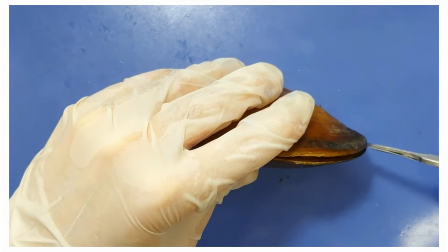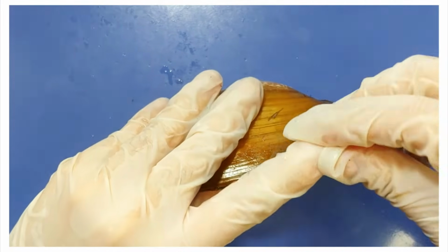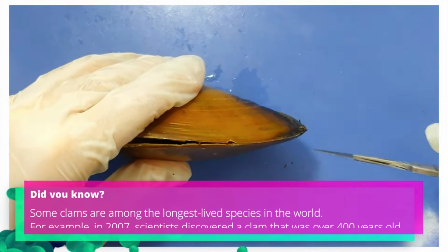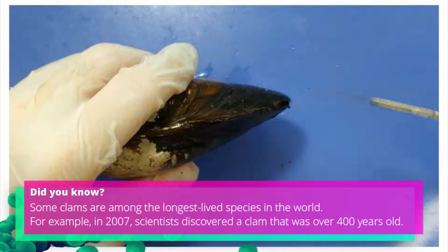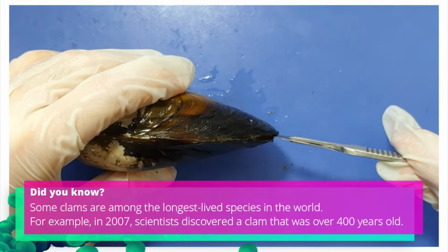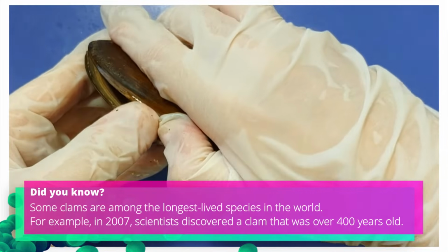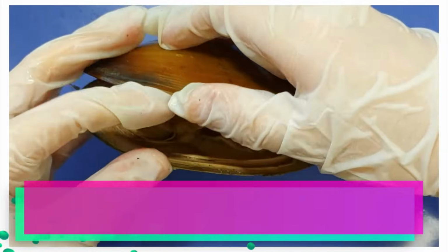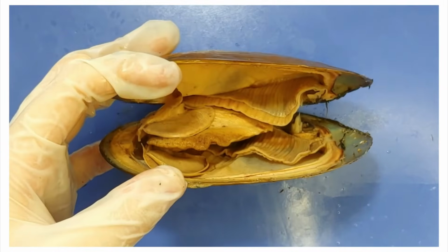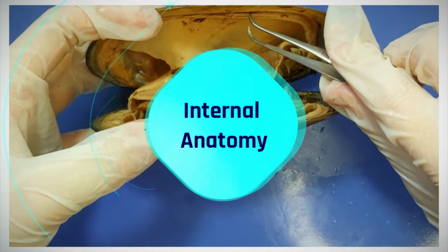Now I'm going to put a blade between the two shells and try to cut through the adductor muscles. Okay, this clam is now open for business. Let's look at the internal anatomy.